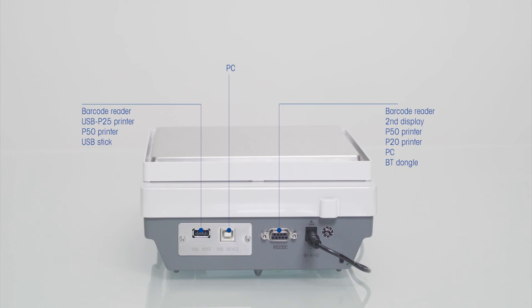USB and RS-232 connectivity along with an optional Bluetooth adapter simplify data upload and transfer. Save time and avoid transcription errors.